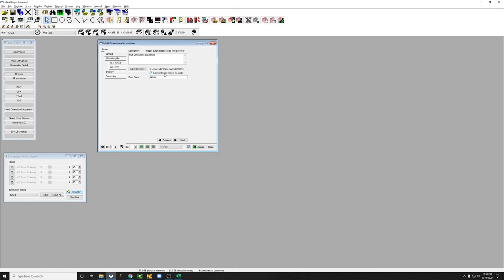I want to increment the base name if file exists. You always want this checked because this will avoid overwriting data. What it'll do is we're going to place a base name, and I recommend you keep this short and sweet. Sample is just fine for now.